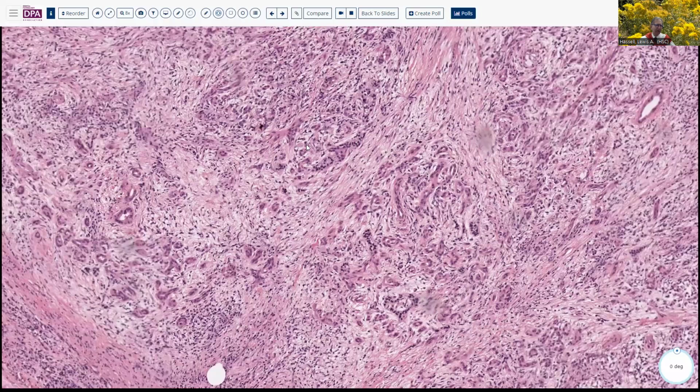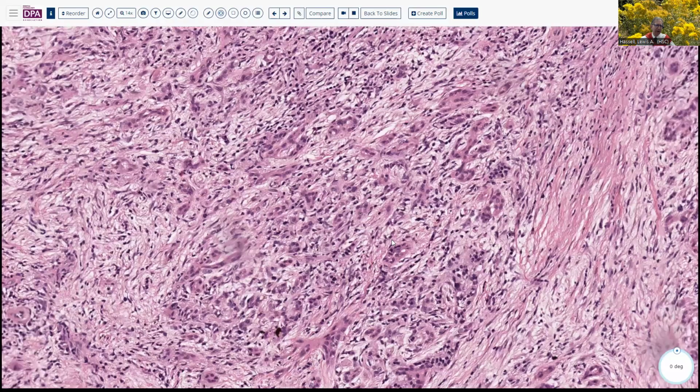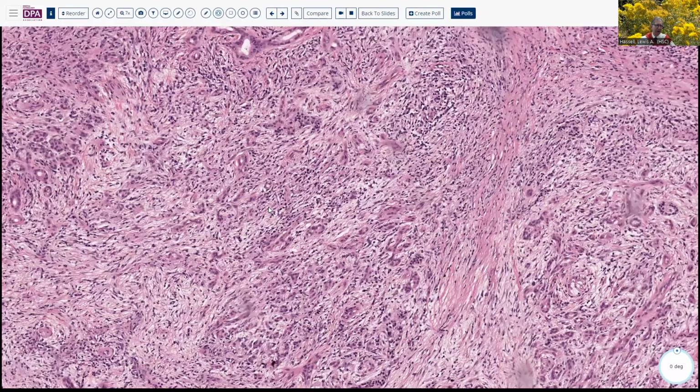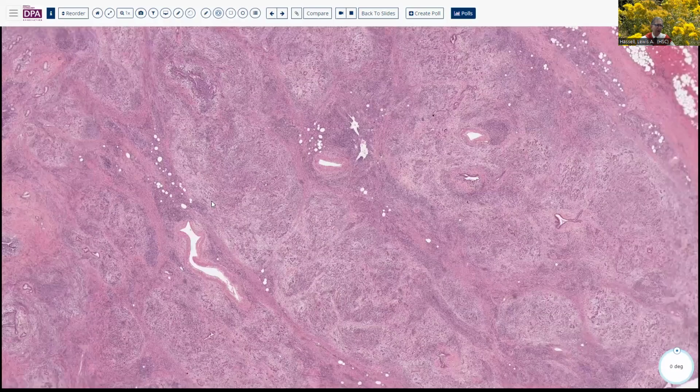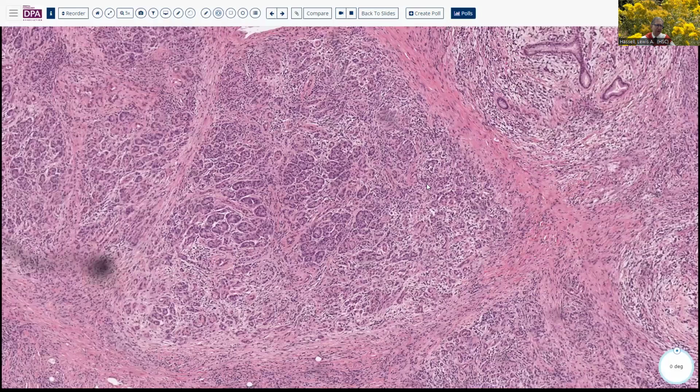Now here you can see that the atrophy of the acinar component has progressed to a greater degree. We have very little residual acinar tissue. So the likelihood of recovery at this stage may be lower due to the fact that you've already destroyed a great amount of the acinar parenchyma. But since this doesn't tend to involve the entire pancreas, if you can gain control over this, the residual or reserve in many patients will be sufficient to allow them to function adequately.